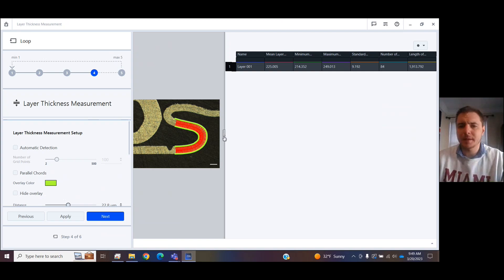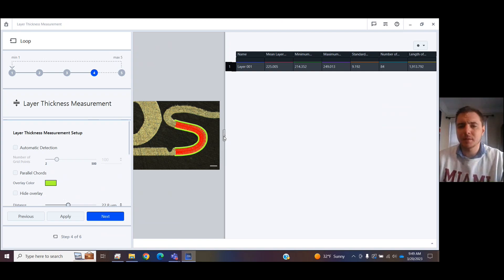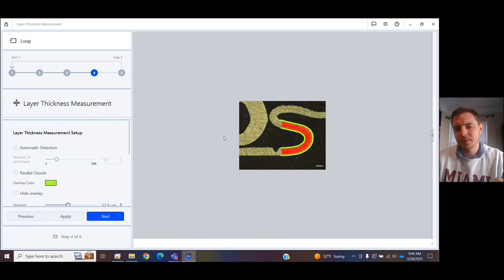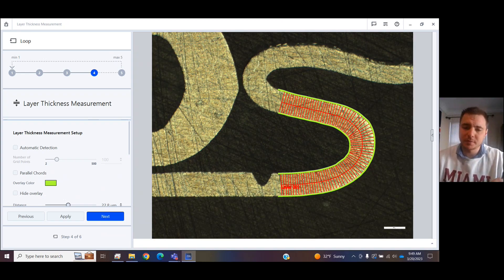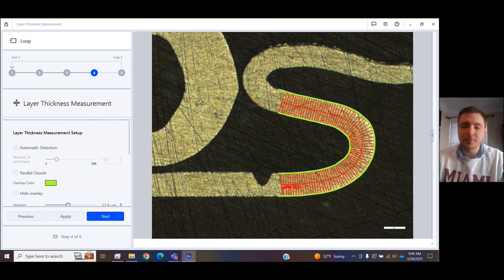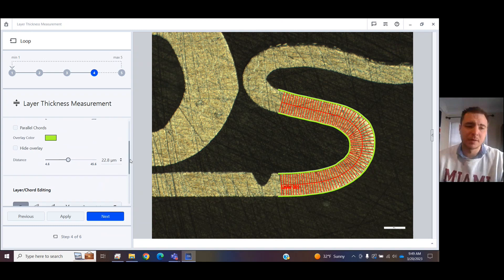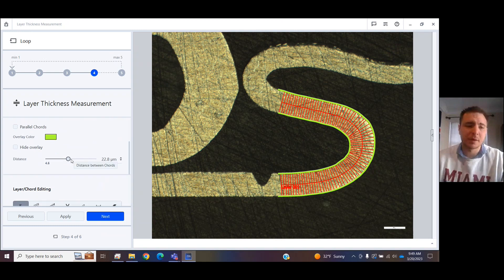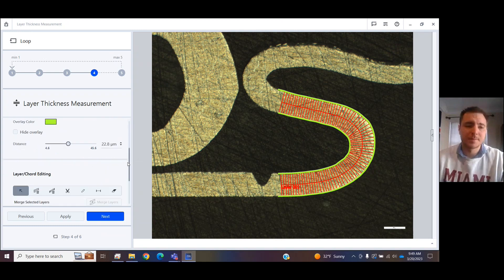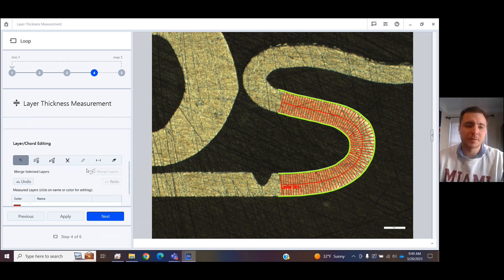But I can hide that. And we see that it has traced what it thinks are points across the layer, and then it will take the minimum and maximum and find an average and tell you the standard deviation. You can choose for the chords to be parallel, how far apart they are.